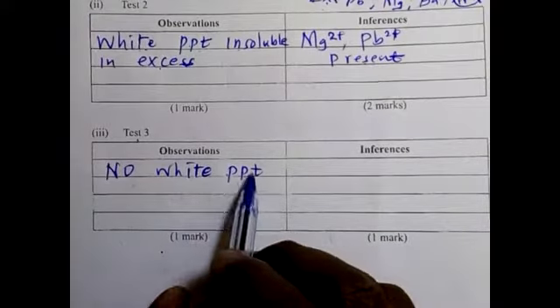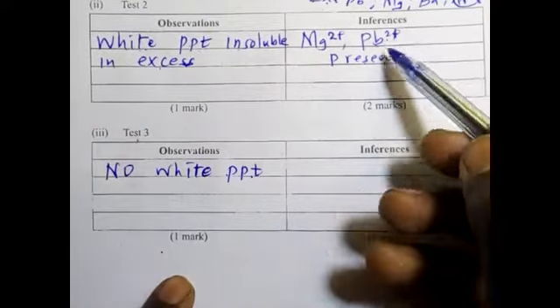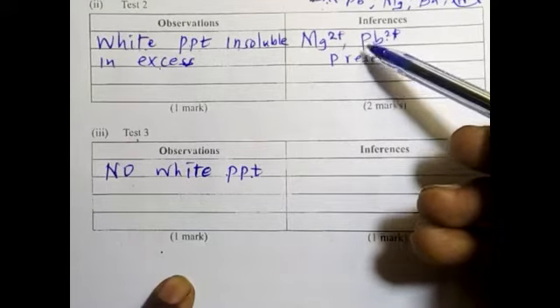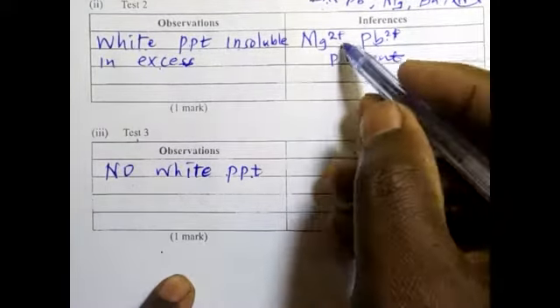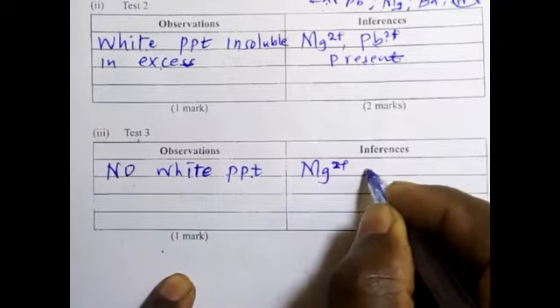So if there was no white PPT, then it means lead ions were not there. Because if the lead ions were there, they would form a white precipitate. But since there was none, here we say magnesium 2 positive was present.